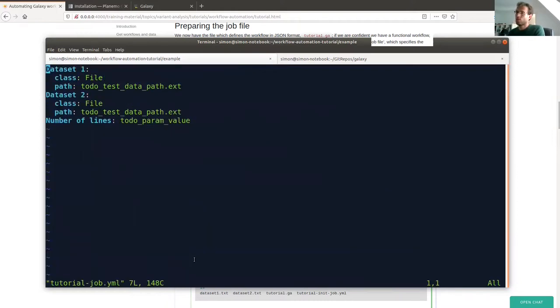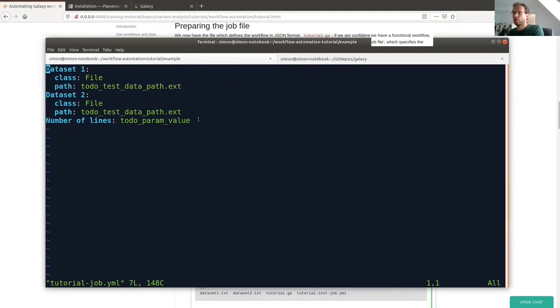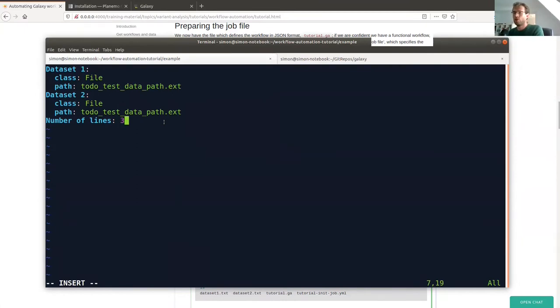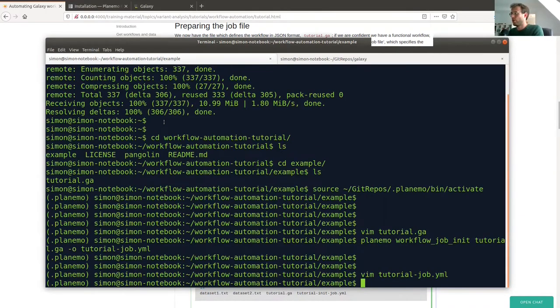The job file is very simple. We have our two dataset inputs — dataset1 and dataset2 — which we saw in the workflow, and the number of lines parameter is also defined. In order to run this workflow, we need to replace these path placeholders with paths pointing to real datasets saved locally on our computer. We also need to replace the number of lines parameter with a particular value — we can set it to 3, for example. For the datasets, we need to first create the files we want to use.